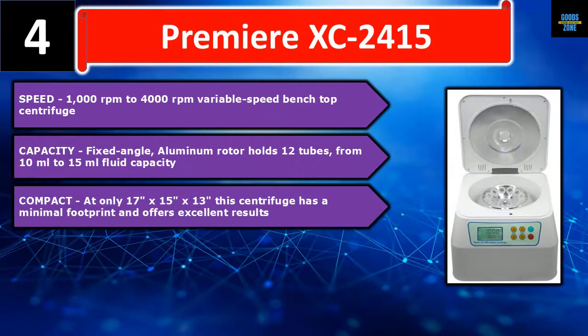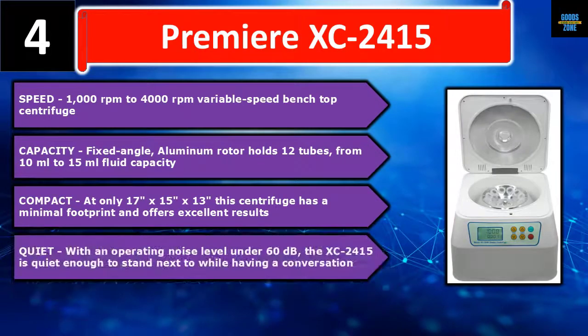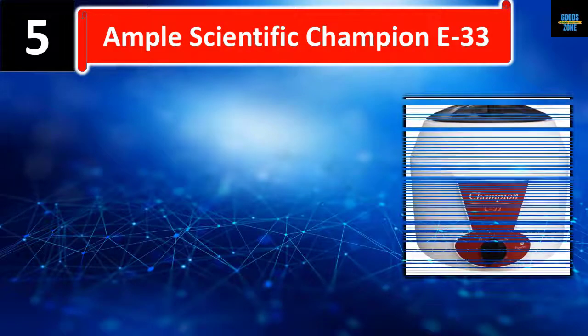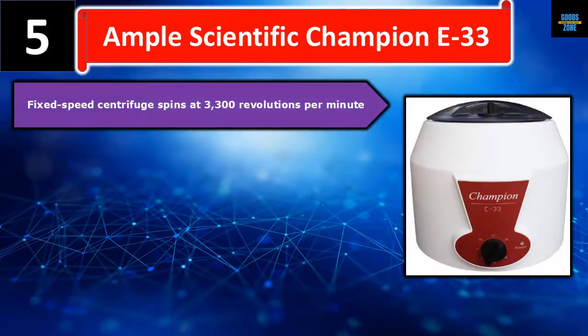Compact at only 17 x 15 x 13 inches, the centrifuge has a minimal footprint and offers excellent results. Quiet with an operating noise level under 60 dB, the XC-2415 is quiet enough to stand next to while having a conversation. Please check the description for details and best price.